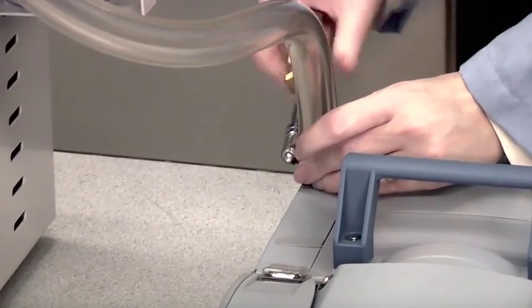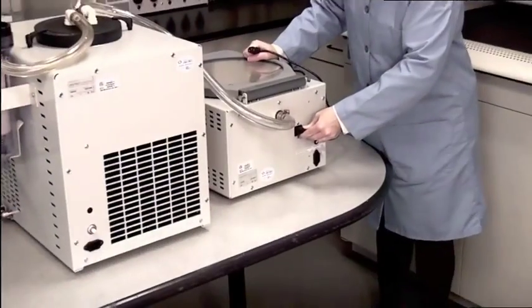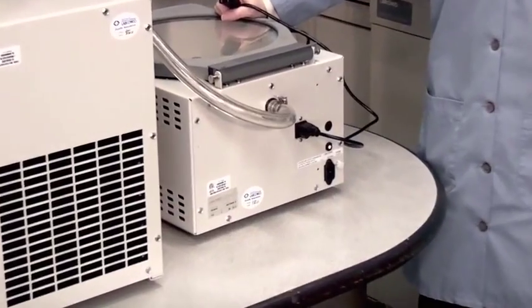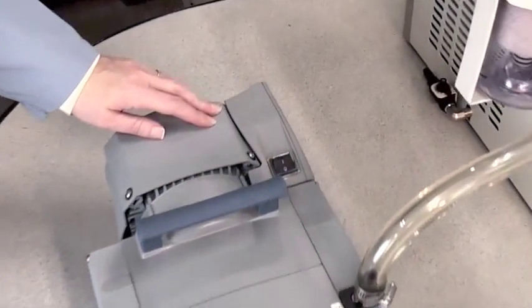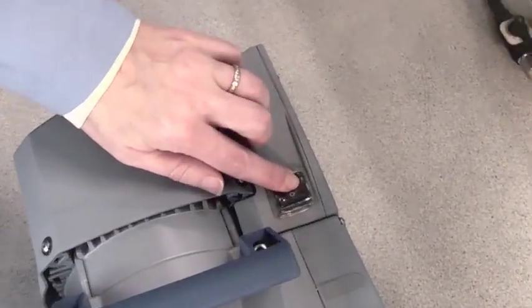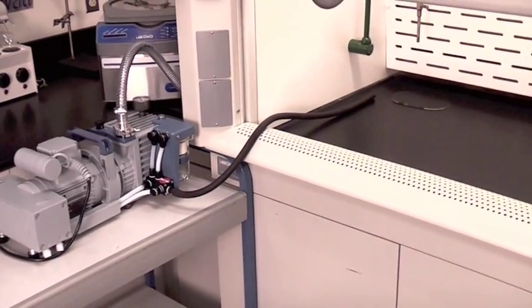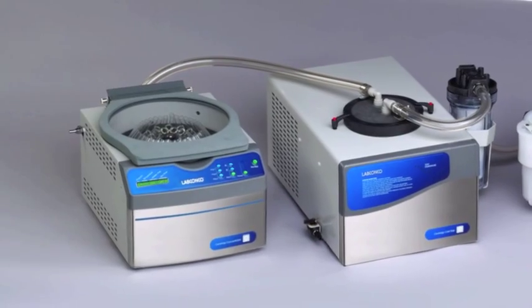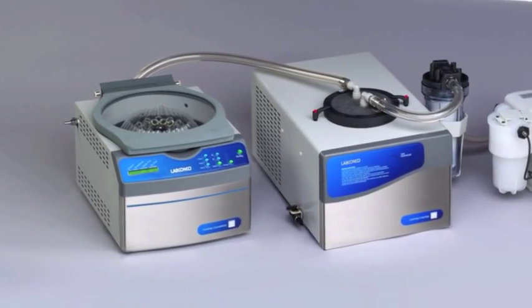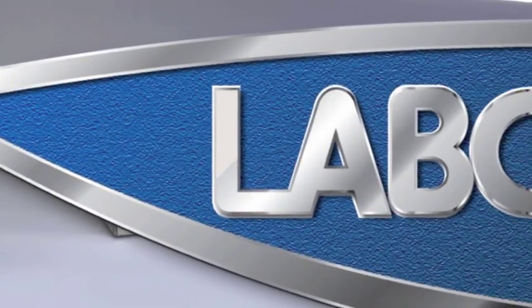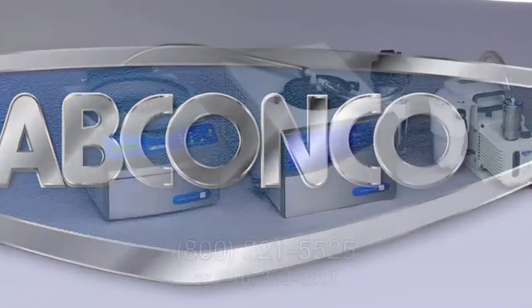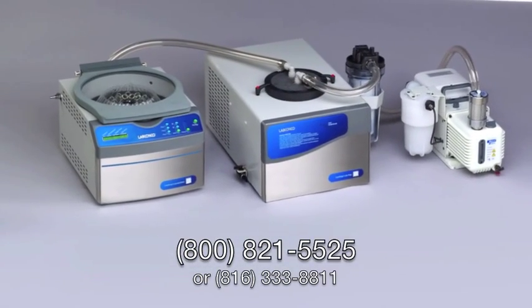Finally, place your pump next to the cold trap and attach the tubing to the inlet. Plug your pump into the back of the Centravap and turn it to the on position. Vent the vacuum pump into a chemical fume hood. If you have any questions during the setup of your Centravap system, call LabConco at 800-821-5525.